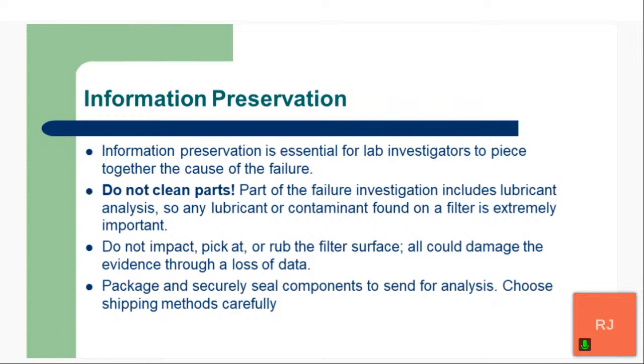And then package securely and seal those components. So getting that filter inside of our tube, making sure that the oil stays in there and is not going to get lost, and then it'll be preserved for the laboratory for analysis.